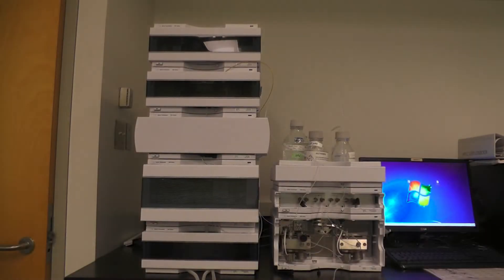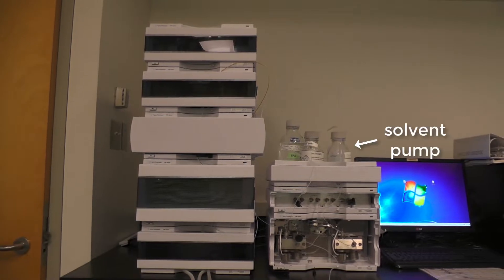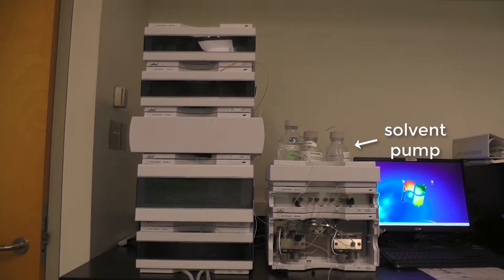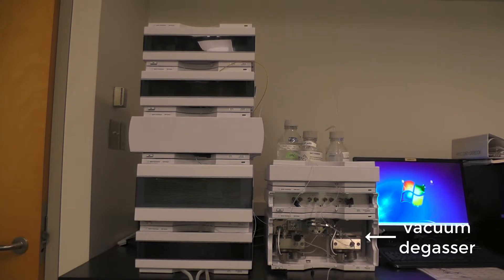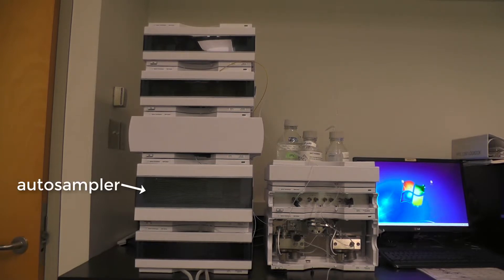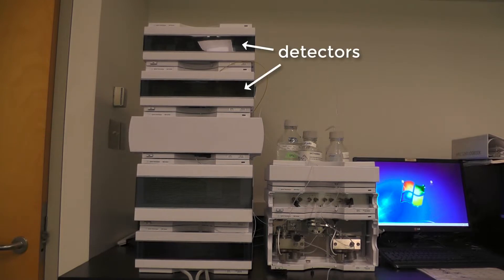The HPLC system consists of several modules including a solvent pump with solvent cabinet, a vacuum degasser, an auto sampler, a column compartment, and two detector modules.